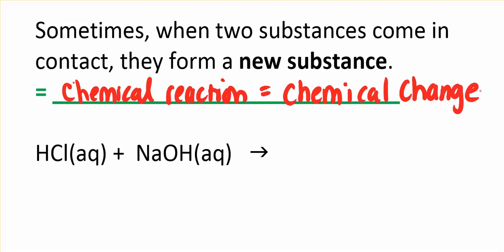So in our example, we're going to use hydrochloric acid. This is a strong acid. It's very harsh. It's corrosive. It will burn you. This is a solution. It's in water, so it looks like water, but this solution will burn your skin if you get it on your skin, so you'll wear gloves for it.